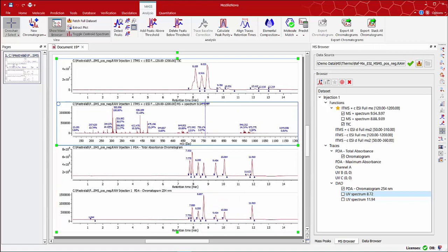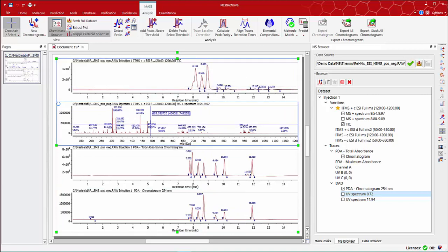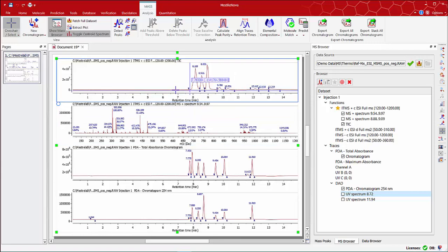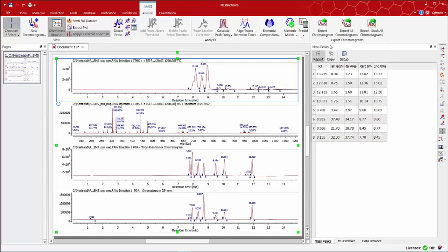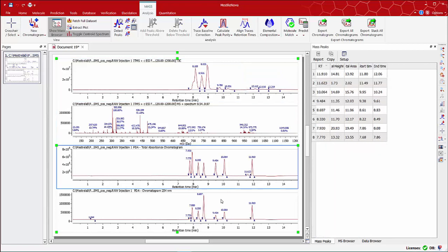You might have noticed that on the TIC and mass spectra, peaks are automatically integrated or picked. The results can be displayed on the mass peaks table, which you can find on the main toolbar. Depending on the selected part of the spectra, the mass peaks table gets automatically updated.